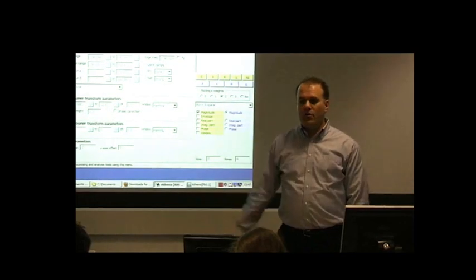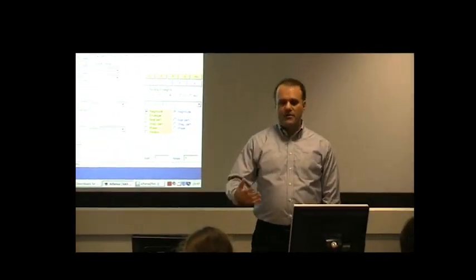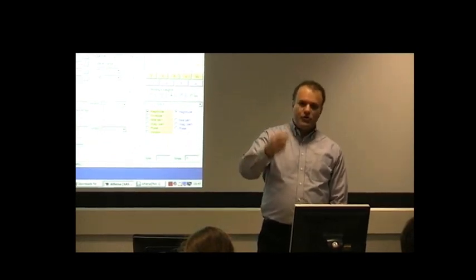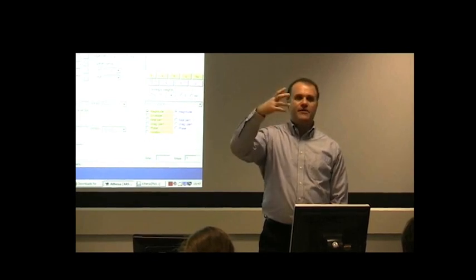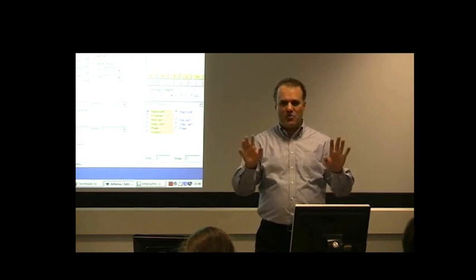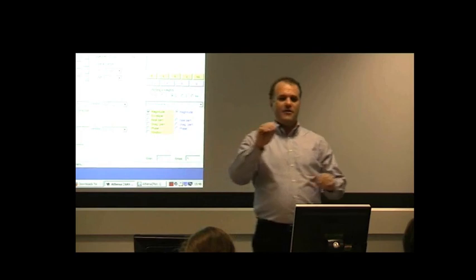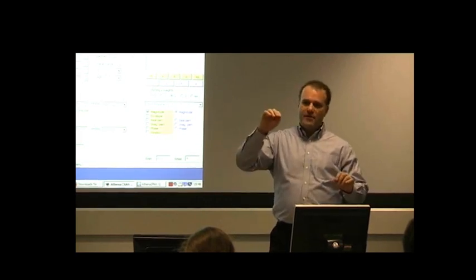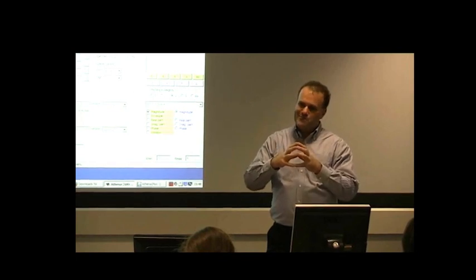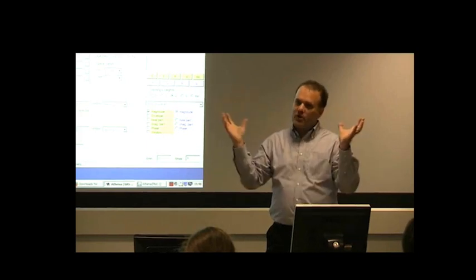So the difference between the background and the oscillatory part is the difference between the signal due to the promotion of the deep... And okay, this is a little bit hand-wavy, and some of the people in the back of the room would find fault with what I'm about to say, but it's mostly right. The background has to do with the part of the absorption that just has to do with the central atom. And the wiggly part is the part that has to do with the presence of all of the other atoms.